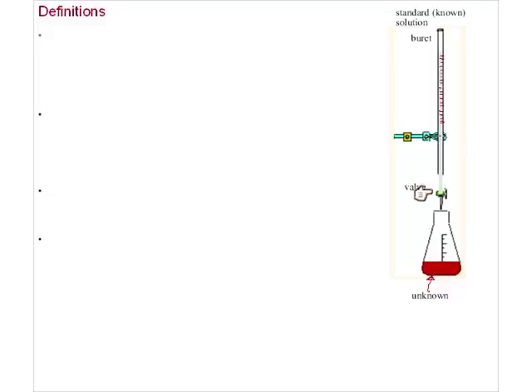This burette has a drain valve, which we can very accurately, very carefully use to start adding or mixing these two together. We can record a measurement before, which is our initial volume that we started with, and we measure a volume once we finish the titration. So we have 2 volumes, we subtract the difference, and we know exactly how much of that solution we added.